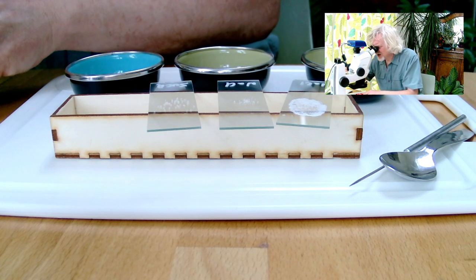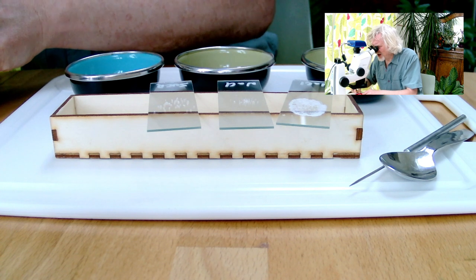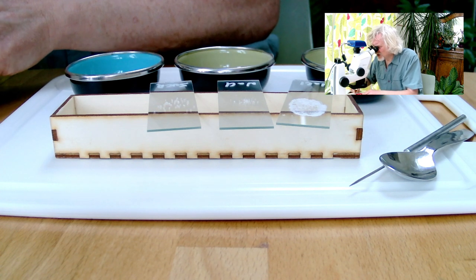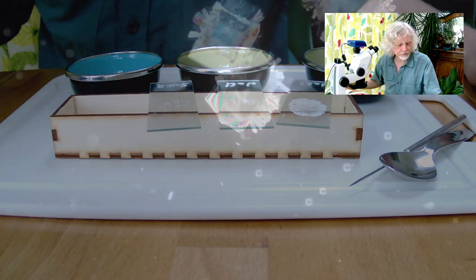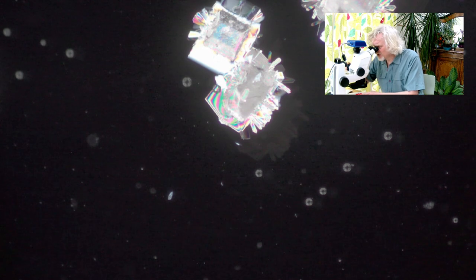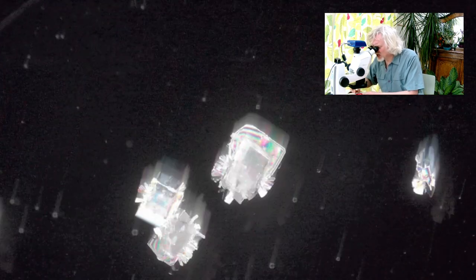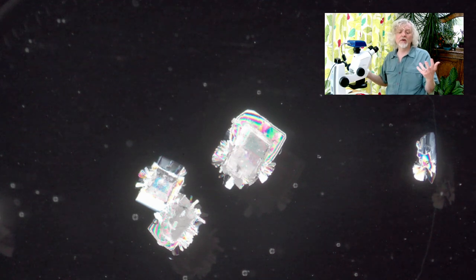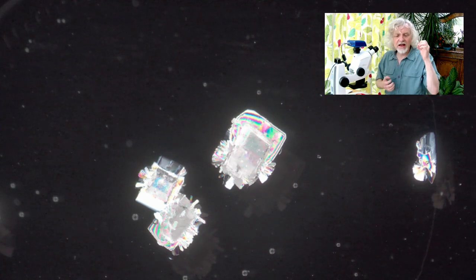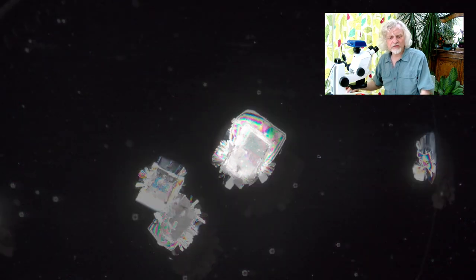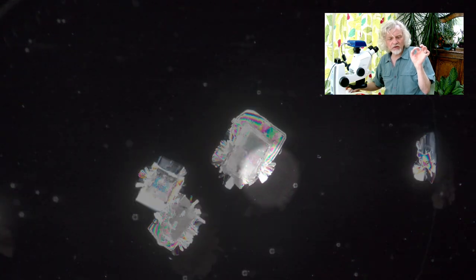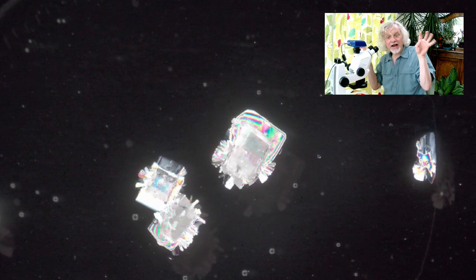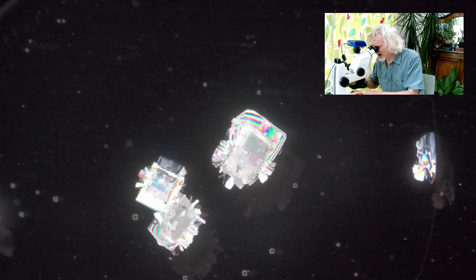But this one's rather fun, actually. I've got two here. I'll show you the starting off one first. So this is what happens when you just start it off. You get stuff looking like this. This is actually a little splat of liquid. You can't really see the liquid because it doesn't color up. And then there's a couple of little sugar crystals. So these are the three sugar crystals I dropped in originally. But you can see they're starting to grow. These little, can you see here, there's these little hairy bits growing out the side of the crystals.